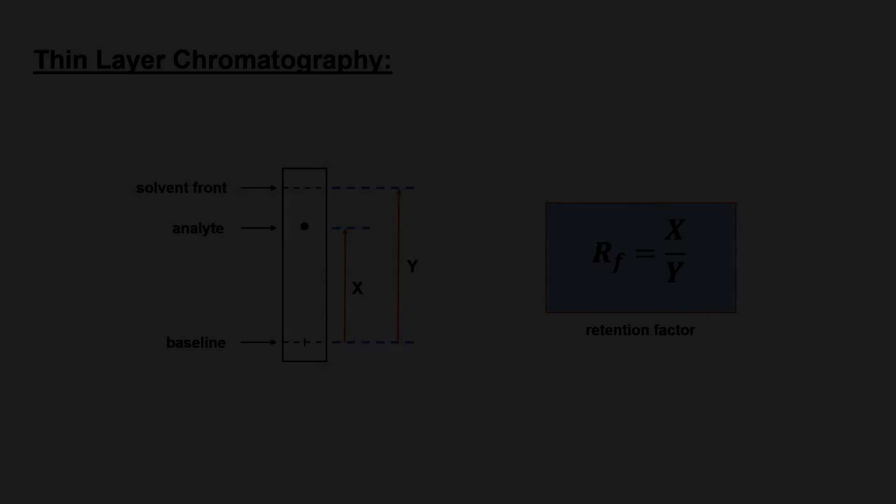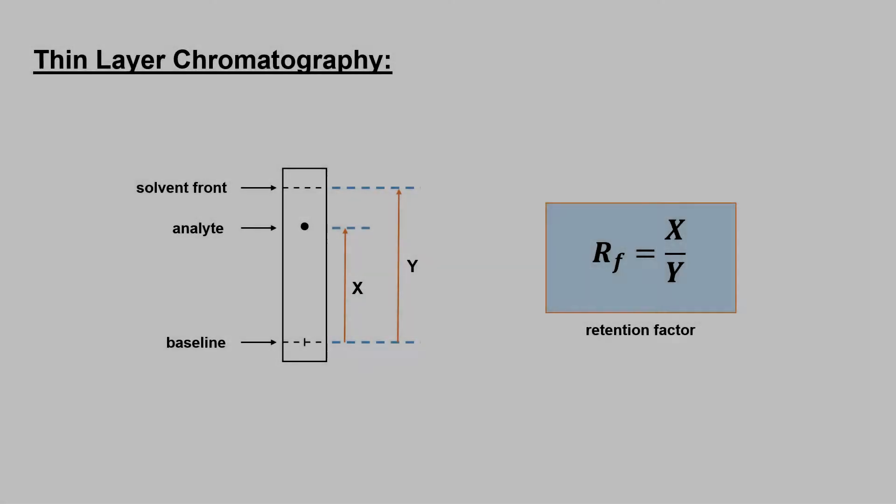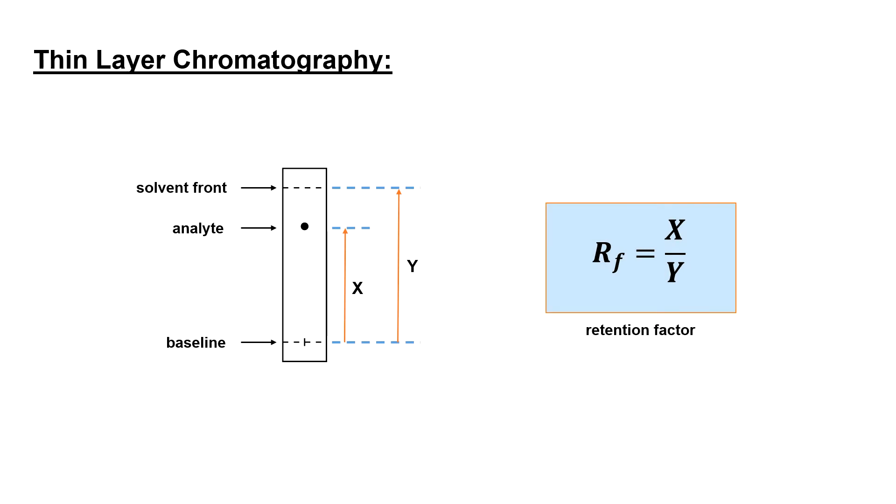A TLC analysis will be conducted to assess the purity of our product. To do this, we will compare the RF values of our starting material, the crude product, and the recrystallized product. In order to see a difference between the starting materials and the product, the proper solvent ratio must be used. Here we use a ratio of 6 to 4 dichloromethane in hexanes.